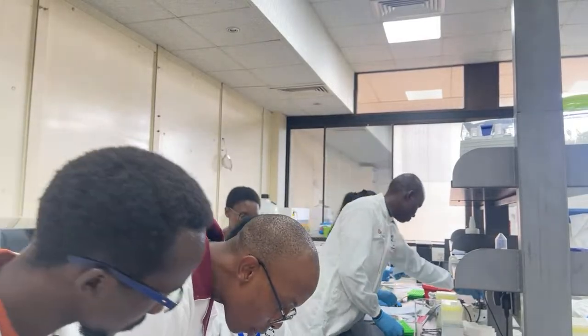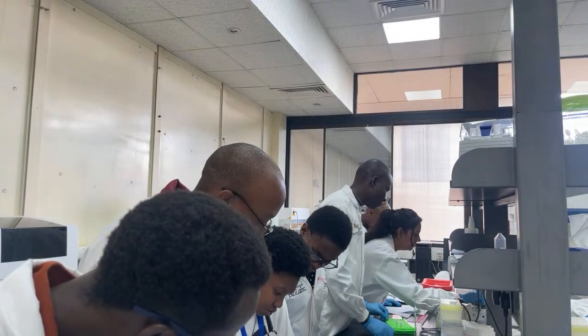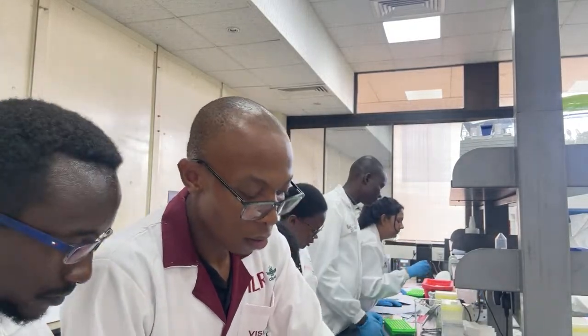Wait, where are we? Okay, yeah, number 17 now. We need Buffer SB. Yeah, Buffer SB.